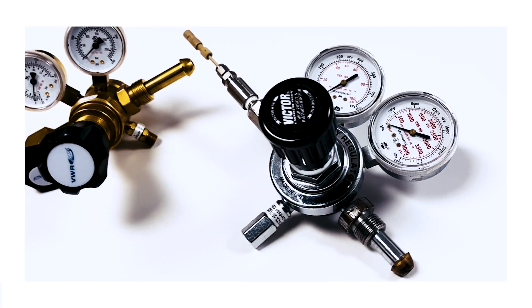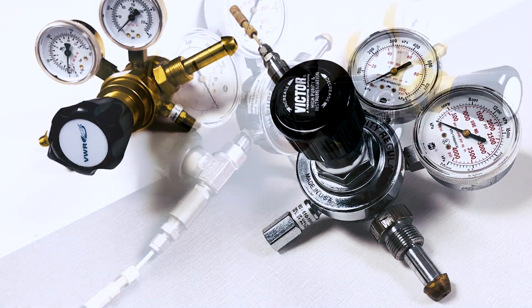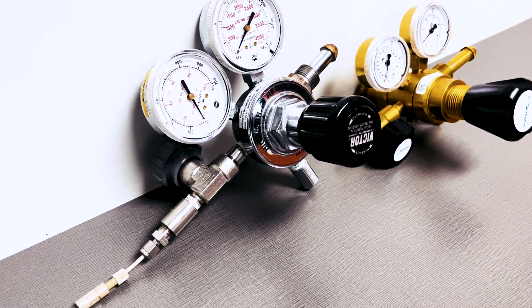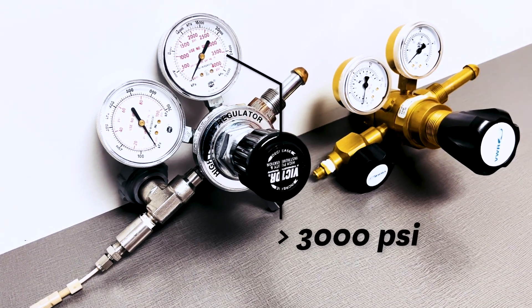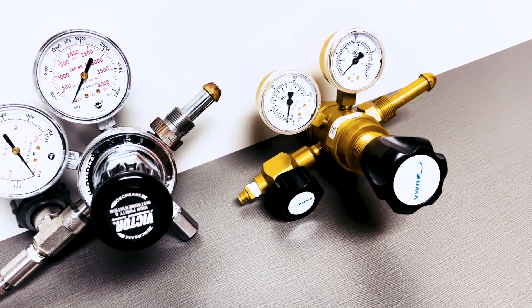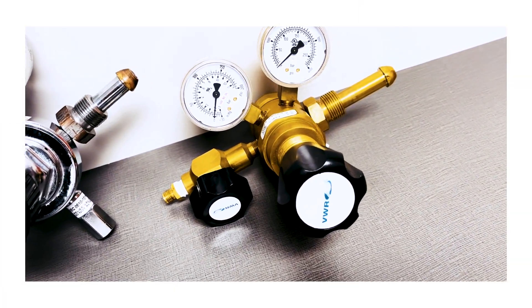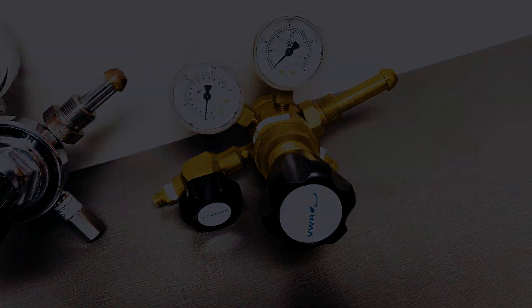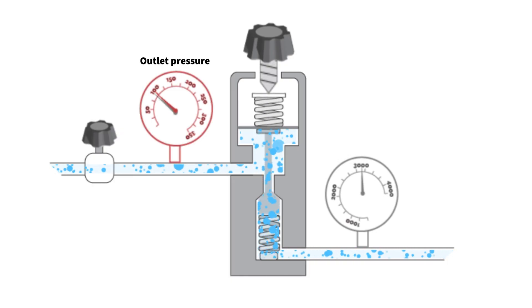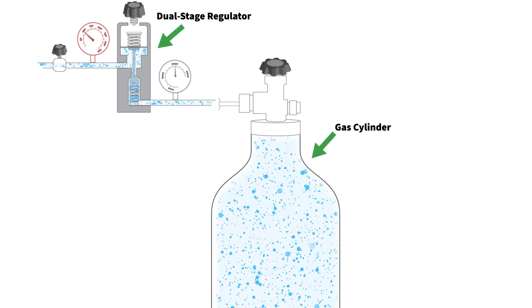All gas users should know the basics of what a pressure regulator is and how it operates. Gas cylinders operate at high pressures, which depending on the gas and the cylinder type, may be more than 3,000 pounds per square inch in a full cylinder. This extreme pressure is more than enough to explode most equipment and tubing, so it needs to be reduced to lower levels for safe use. The outlet pressure should remain constant at the desired value even though the cylinder pressure will vary depending on temperature and how full or empty it is.